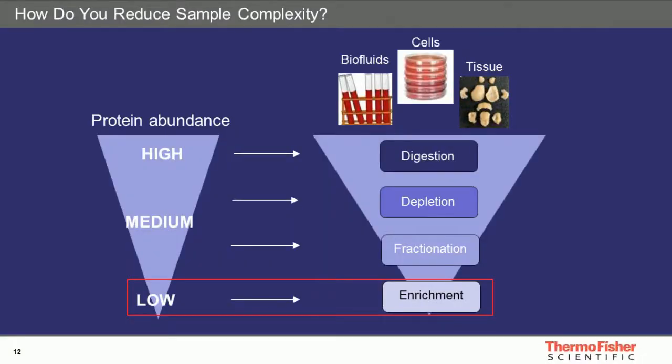So to summarize, what we have so far discussed is that we face a particularly tough challenge in proteomics and biological research focused on pathway analysis, as we're trying to measure many proteins belonging to this particular pathway that may actually be present in the sample at very low abundance. For a particularly successful experiment, we have to combine advanced and improved sample preparation strategies with the advantages of modern protein quantitation techniques such as mass spectrometry to achieve the goal of complete pathway analysis.